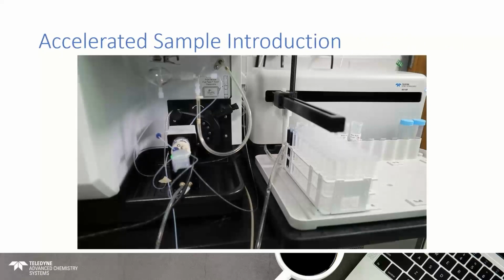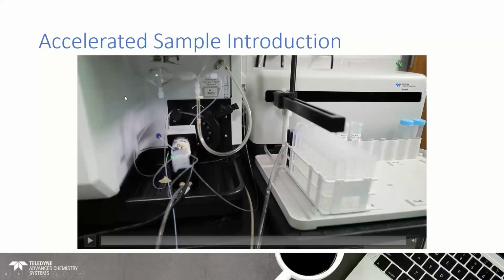Just to give you an idea, there are 2 pieces of video footage I wanted to show you. The first one is just a general introduction, just to show you visually how this actually operates. Before I start this video, on the right-hand side of the screen, we have got our auto sampler.